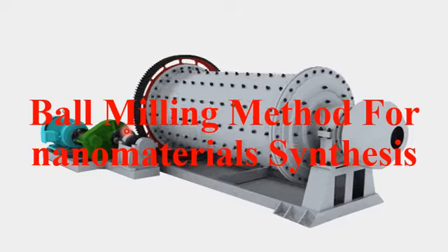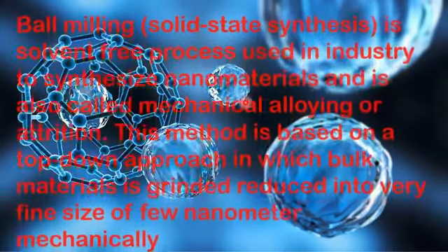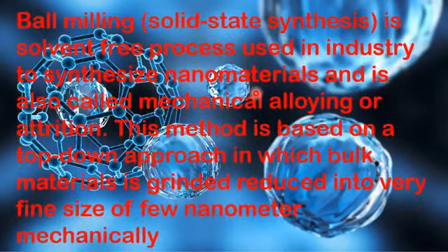So dear student, if I define the ball milling or mechanical milling method in simple words, it is known as a solid state synthesis method.